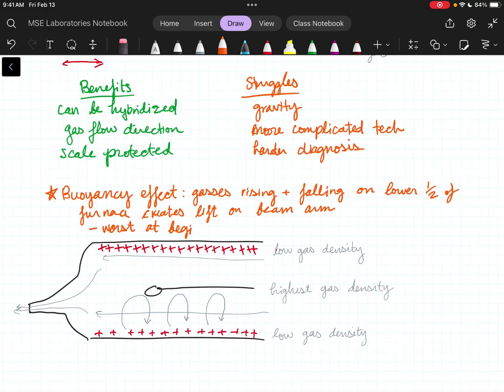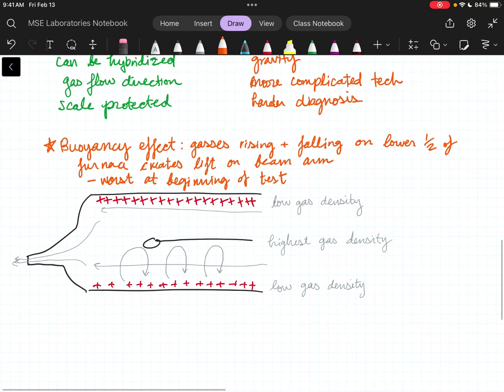So you use the temperature sample a couple seconds after that happened, the weight measurement, so that you can say, oh yeah, all that stuff was just bad data, and we start here. Yes, so people ignore the first several minutes of data. The instrument will show it to you, and you can be like, ah, yes, look, the buoyancy effect. Things are going weird for a second. It's usually not a big deal.